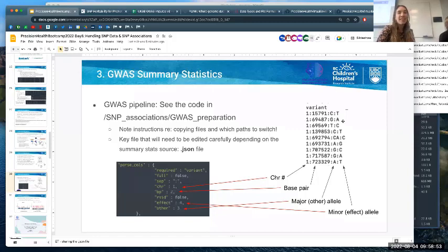That's a great question. And this is also the biggest problem when people use a VCF compared to this format, because a VCF is all relative to the reference genome, where there is no major or minor concept. It's what is the reference and what is your sample. Sometimes that's one of the biggest problems, and why you have the quality controls, because you have this flipping, which I think they're going to talk about.